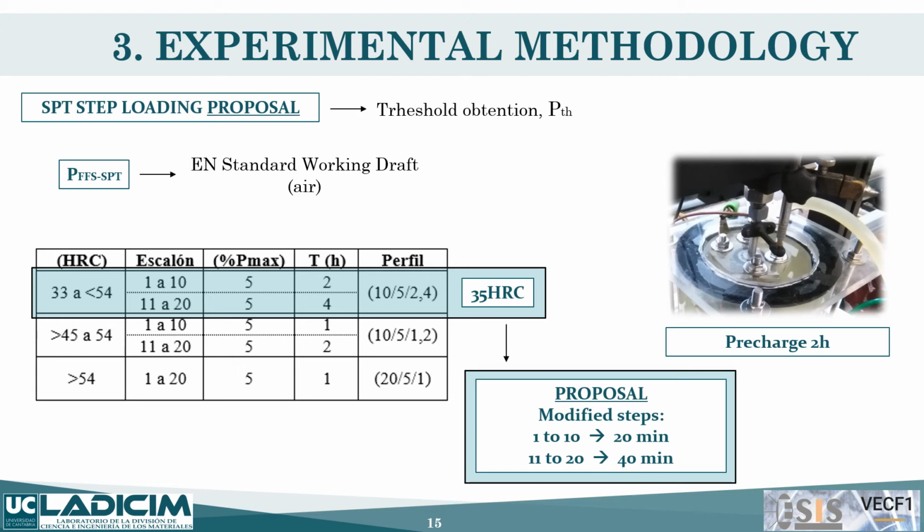And as we needed to start by trying some time, 20 and 40 minutes was convenient because the 20 steps will be 600 minutes, which is a total of 10 hours. So a test could be performed in a working day.